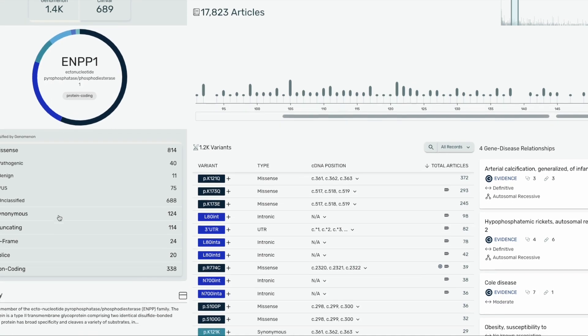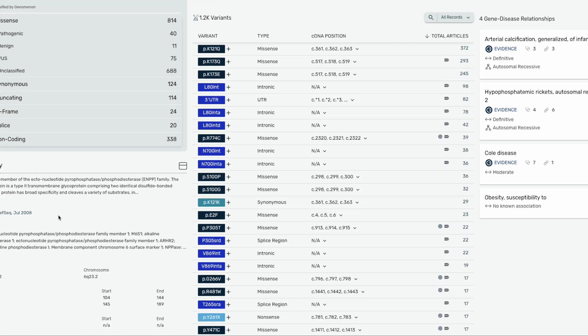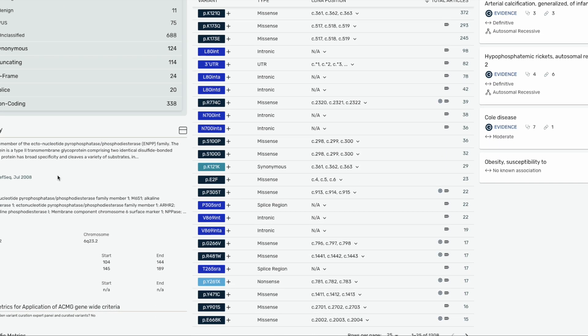Next, I'm going to scroll down to the gene summary information where we provide a functional summary of your gene, synonyms or other names for your gene, the canonical transcript, chromosome location, critical protein domains, and protein shifts if they are present.